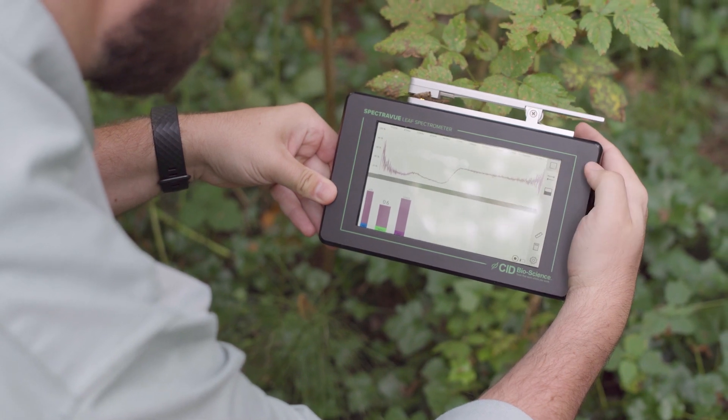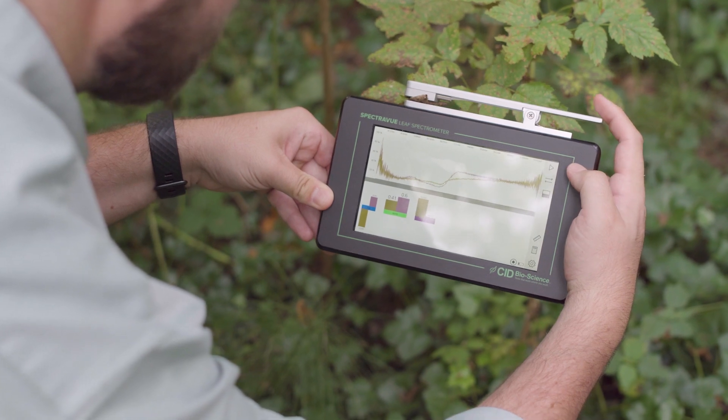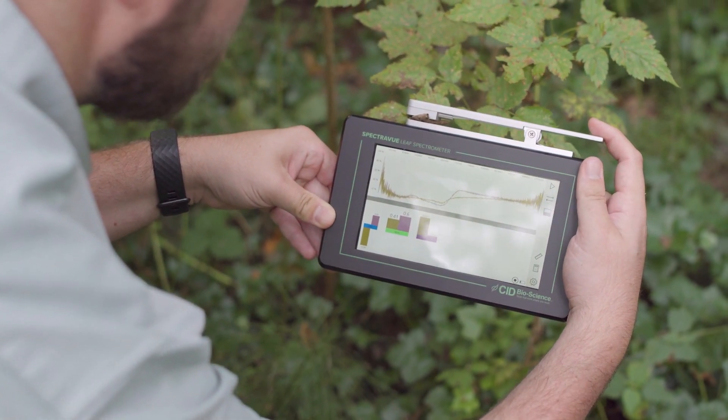We're going to press the scan button, and within a second we should receive a second scan as indicated by the second color of bars and the second line within the spectra window.